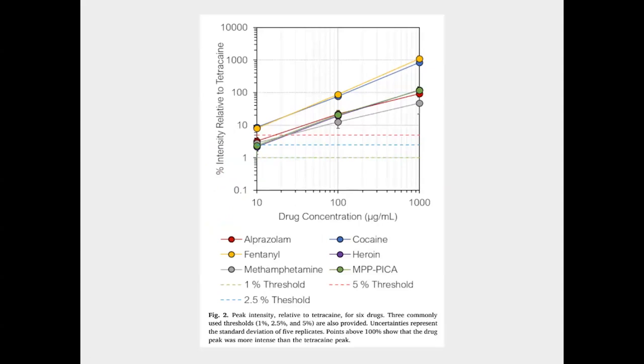And this just shows that all of the compounds were detected above 2.5% threshold of the internal standard. We chose 5% just to be a little bit more conservative, but you could definitely set it to 3% and still have good data integrity. One of the benefits to setting it a little bit lower is heroin does not ionize as well as fentanyl and some of the other things in a typical heroin mixture. So sometimes we'll see heroin, but it'll be below the 5%. And, you know, if you set it to 2 or 3%, you would be able to pick up heroin more frequently.